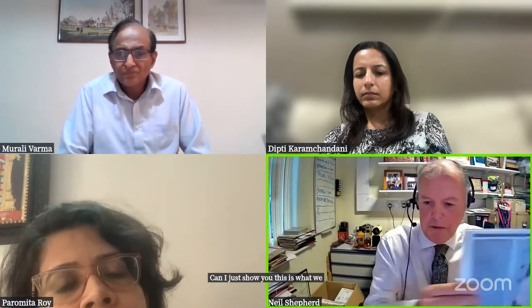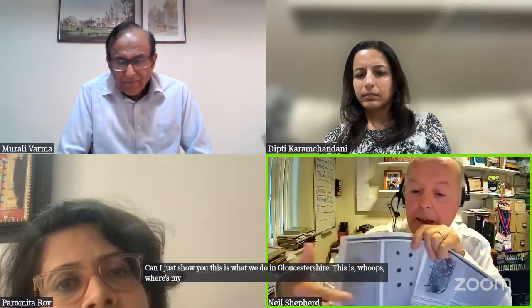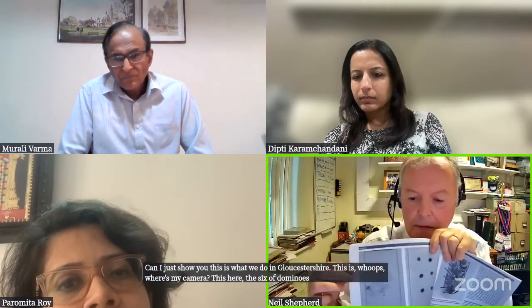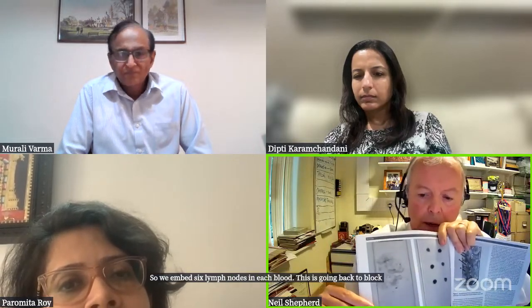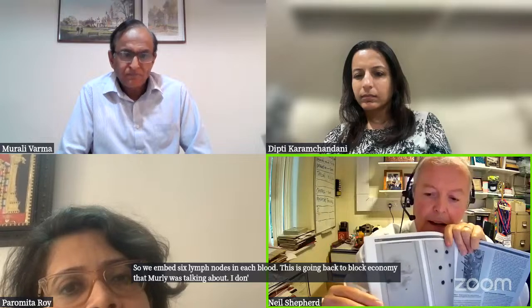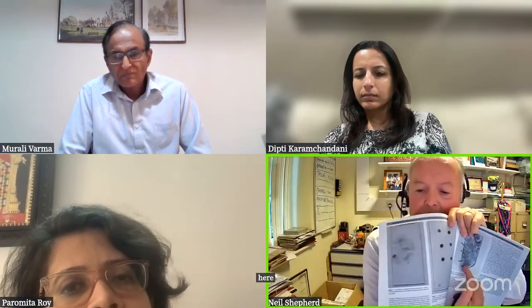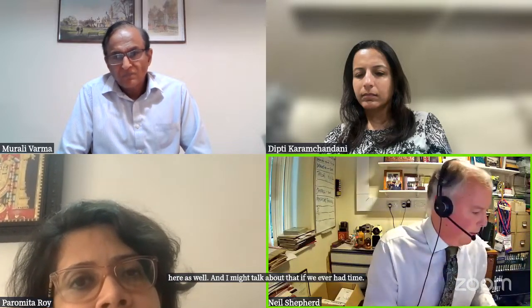Go on, Neil. Yeah, I'll just talk about lymph node harvest again. Can I just show you what we do in Gloucestershire. Where's my camera? This here, the 6 of dominoes. So we embed 6 lymph nodes in each block. This is going back to the block economy that Murali was talking about. I don't know how well you can see that. You can look at that picture here as well, and I might talk about that if we ever had time. So doing it like the 6 of dominoes.